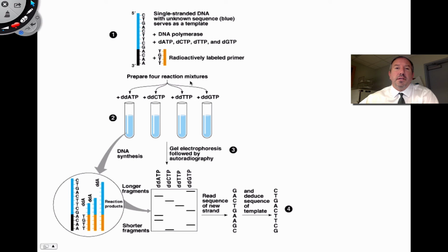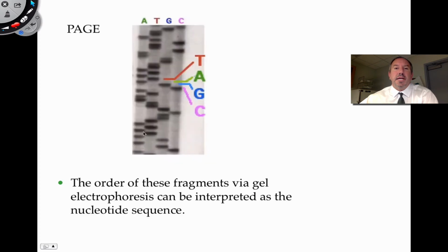And so when you put it all together like this, you can see, again, it's just like PCR. You add your primer, then you add your normal PCR ingredients, your magnesium chloride, buffer, dNTPs, but then you add these ddNucleotides, and those chain terminate the process.